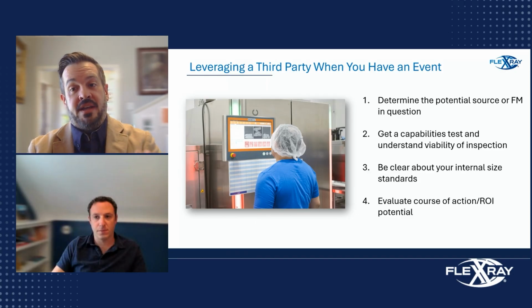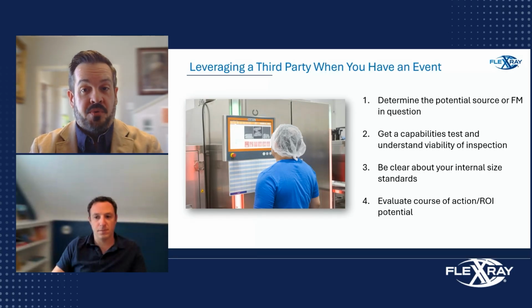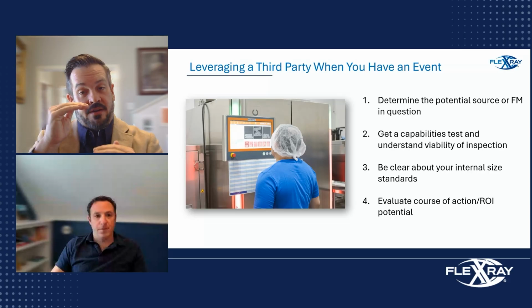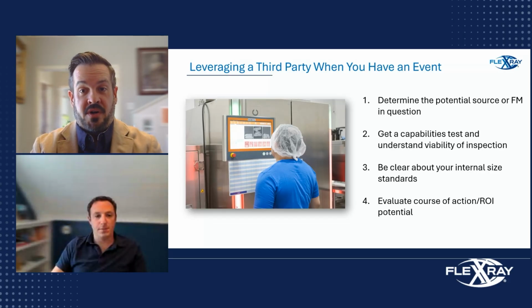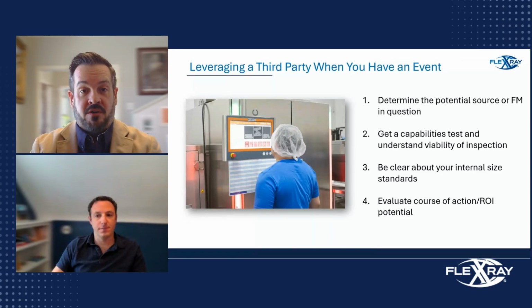And we're going to do that in and out of the case both to try to understand exactly what sizes we can get down to if we eliminate the product layering effect even further. So although CT can remove all those product layering effects, if we can eliminate the amount of product that we're having to pass a photon through, we can separate the density layers even further with less product. So even though CT is more capable than 2D, we can still improve the capability of CT by removing more product layers as well.